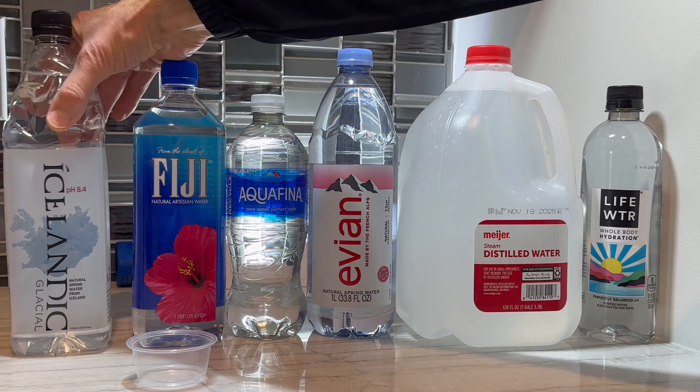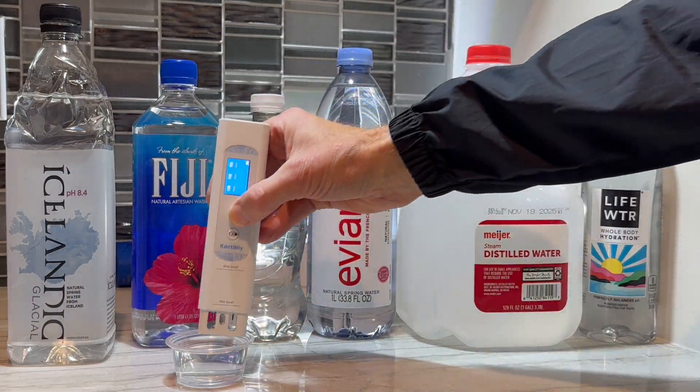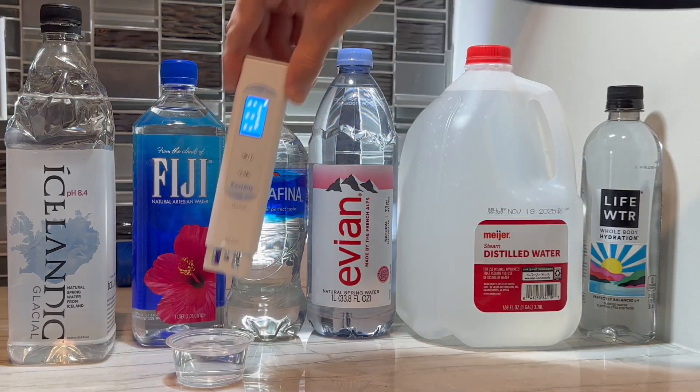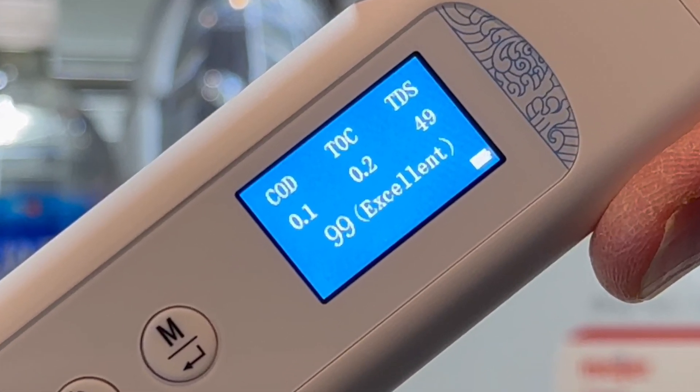Next we're going to test this natural spring water from Iceland. Because this water has been in contact with soil, I'd guess it's going to have some dissolved solids. Sure enough, it looks like the TDS value is 49 parts per million, and it looks like the other two values have bumped up a little bit too.